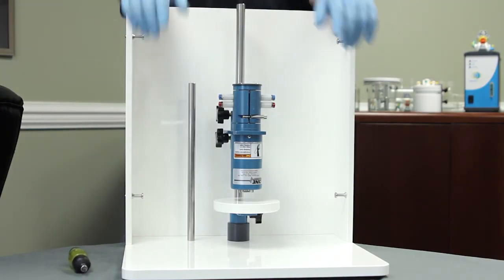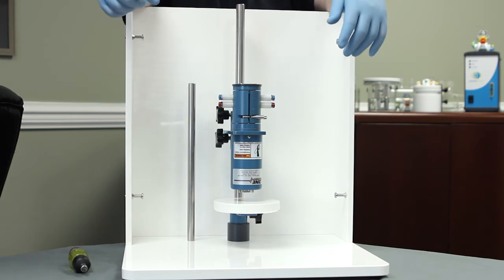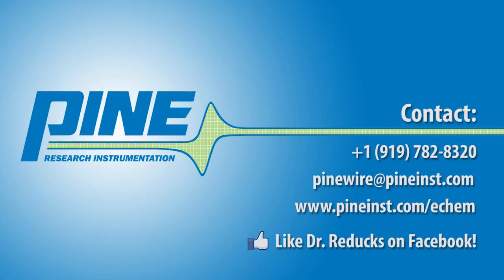That concludes this video on some common aspects of maintenance that you can perform. If you have any additional questions, please contact Pine at the information provided.